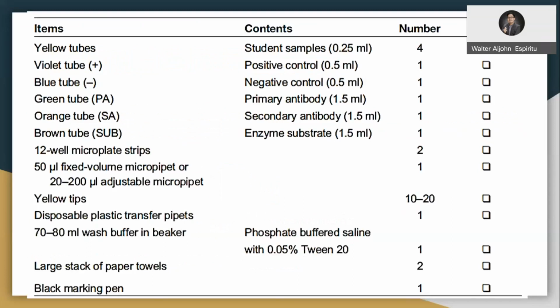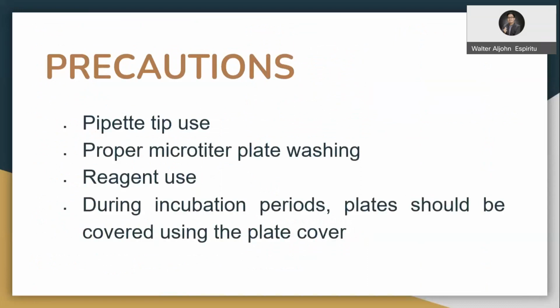Some precautions on this particular experiment. Again, proper pipette tip use and proper micropipette use, because we have limited samples and limited amounts of the enzymes, substrates, and so on. Please be careful in handling, getting, and transferring them.